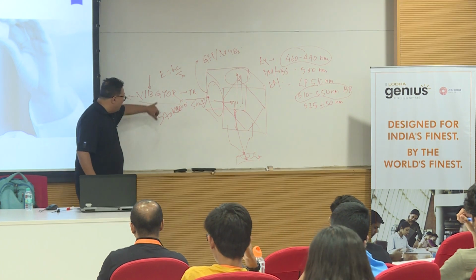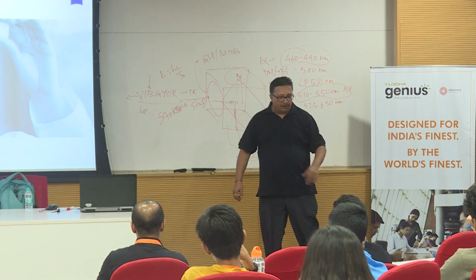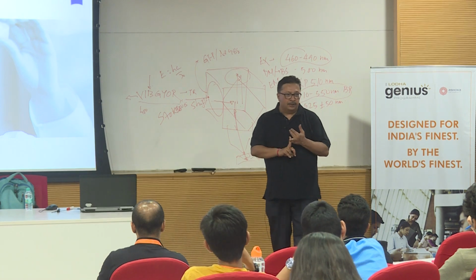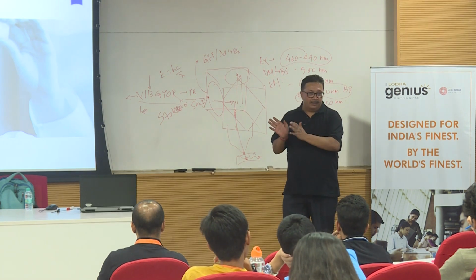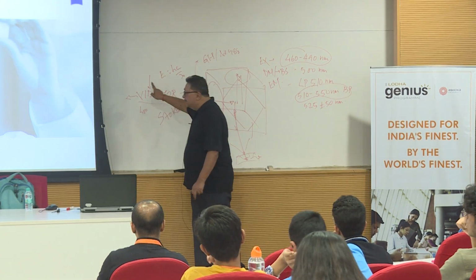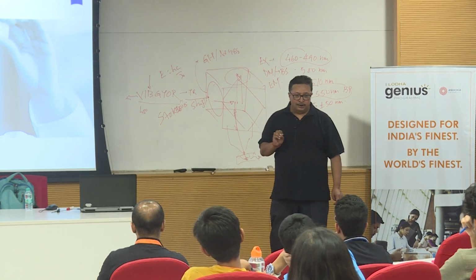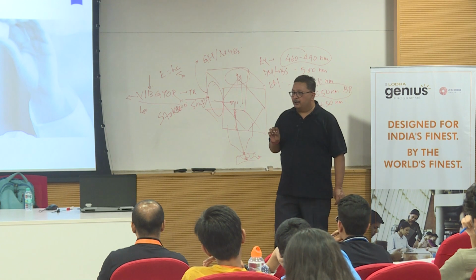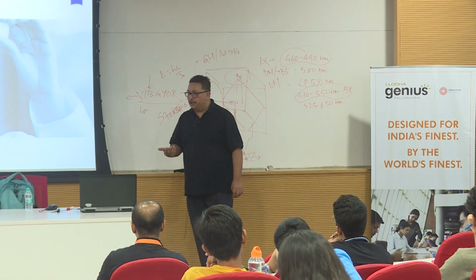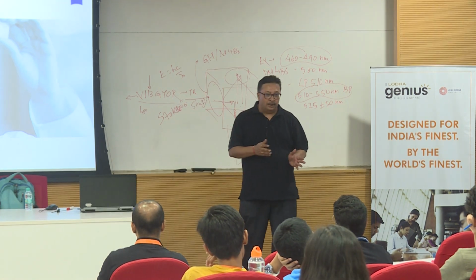So now this white light, so typically what source? Any idea? It can be a mercury illumination, it can be a xenon illumination, it can be a metal halide illumination. So these are different types of white light sources that can be made available for fluorescence. But this is white light, means it's a non-coherent source of light. Anybody understand coherent, non-coherent? Any idea? No. Okay. Anything that changes phase, or there is a phase change, because you see so many wavelengths, there will be some phase change. So these are non-coherent sources of light.